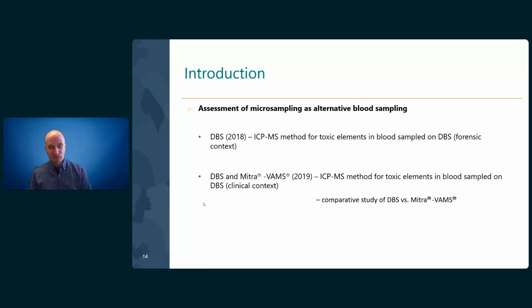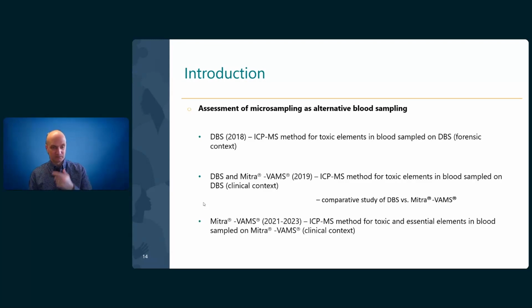And we noticed that it's much more positive and promising. So we did then a comparative study of dry blood spot with Mitra VAMS devices, and finally we adopted Mitra VAMS devices for the future developments. So we started in 2021.